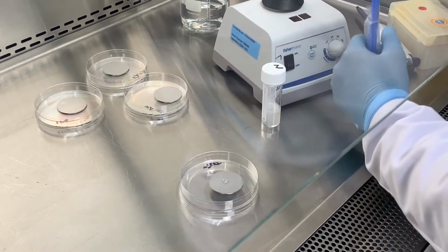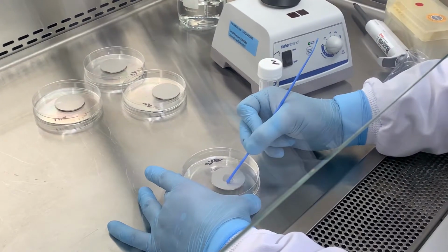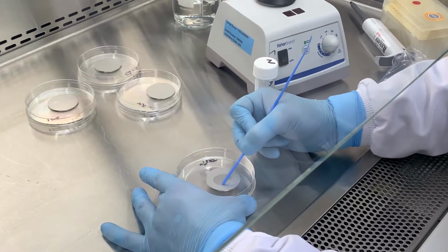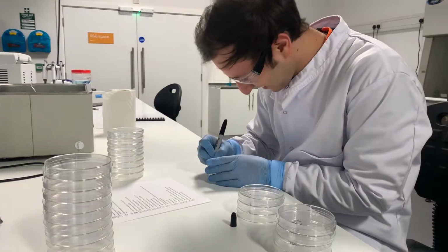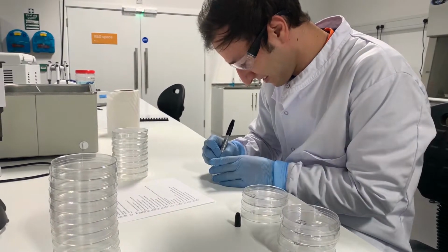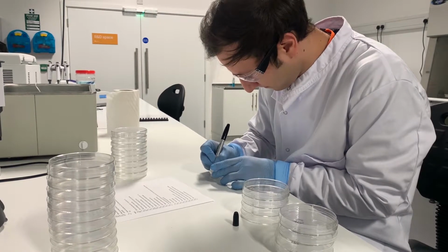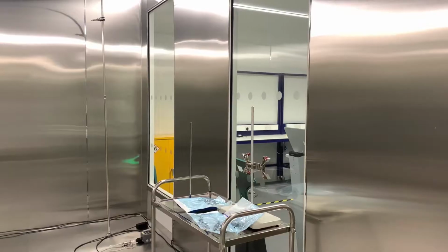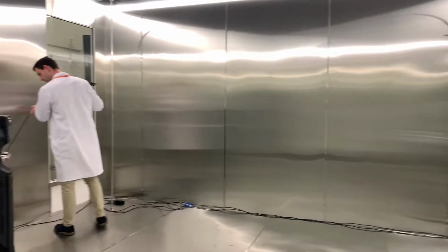The 50 microliters are aliquoted on top of the carriers and spread to a diameter of about 2 by 2 centimeters using a sterile loop. The carriers are left to dry inside a sterile empty petri dish for sufficient time at room temperature under laminar flow or inside a Class 2 safety cabinet. Once dried, the lid is closed and the carriers are transported inside the test chamber.